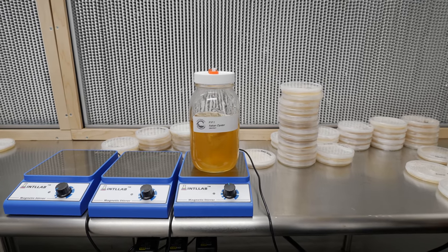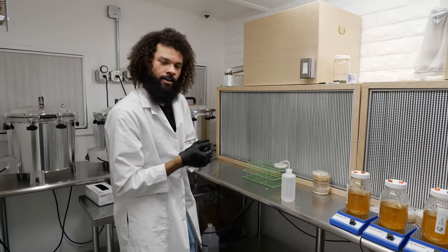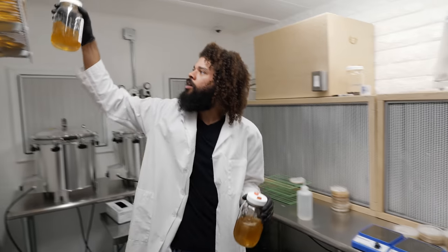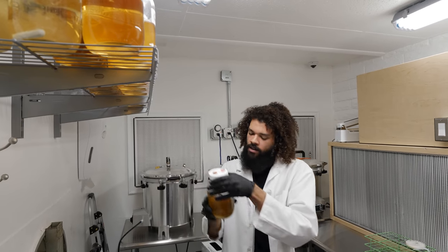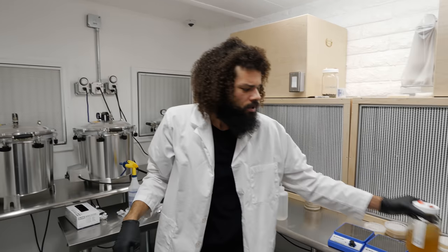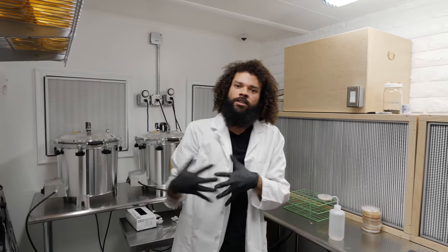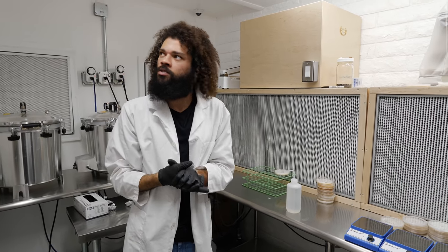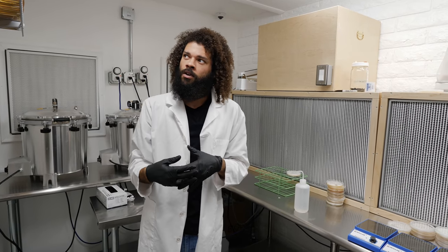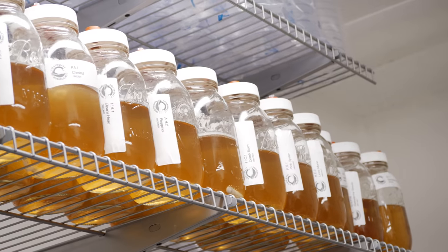All the inoculations have been done. At this point we can set our liquid cultures up here to colonize for about a week and we'll check on them every day, mixing as needed. Once full colonization occurs we can start extracting the liquid culture into syringes and storing them for future use, or we could put the whole jar into cold storage to keep the liquid culture viable for several months — I've seen them go for well over a year as long as they're stored correctly.